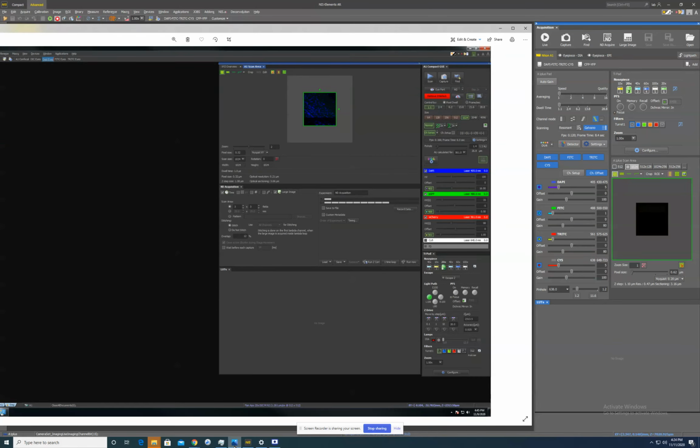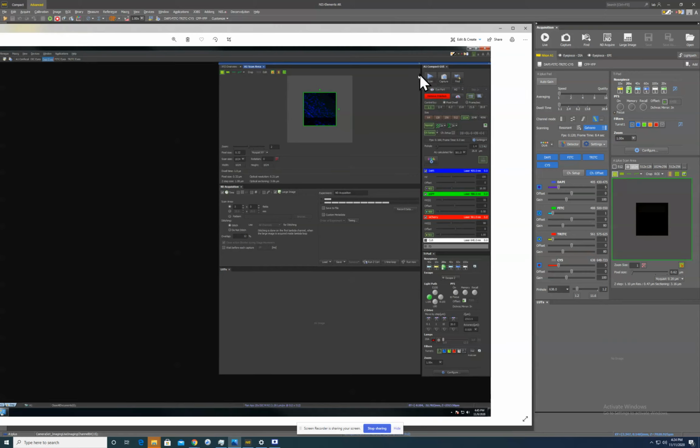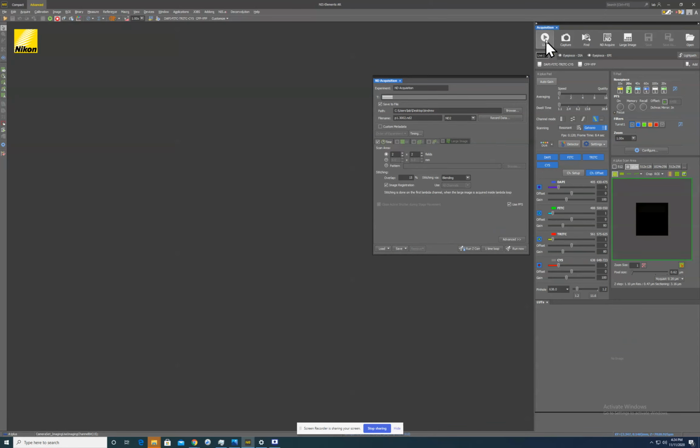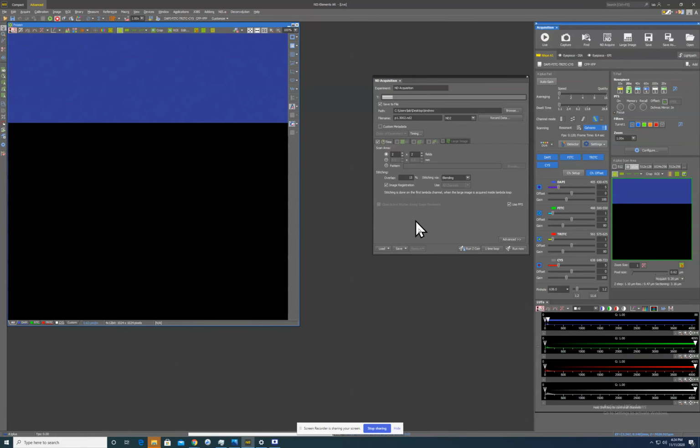And as far as functionality goes, there's one more thing, which is scan. This is how you previously turned on the lasers, is now live. So there you go. And that's pretty much it as far as differences go.